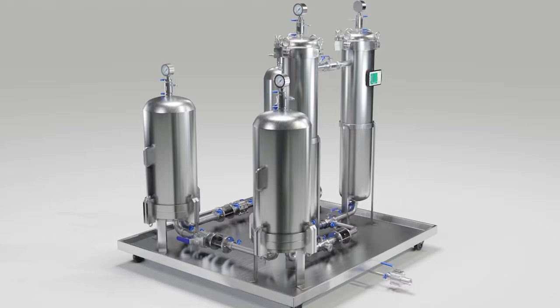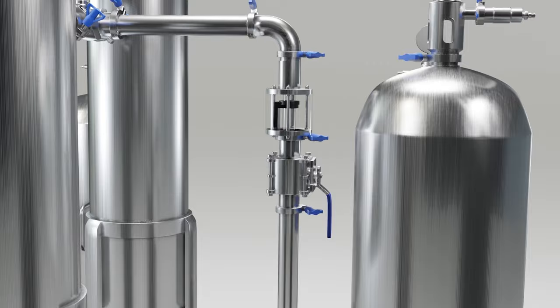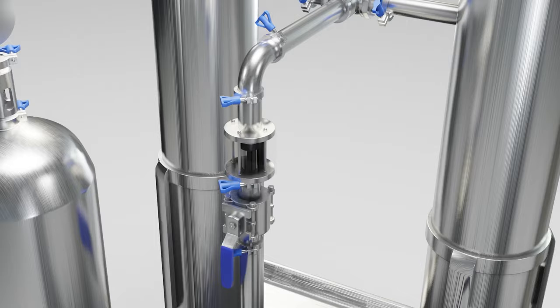Our CanisKid has four filtration stages and will pre-filter, clarify, carbon scrub, and sterilize your solution.